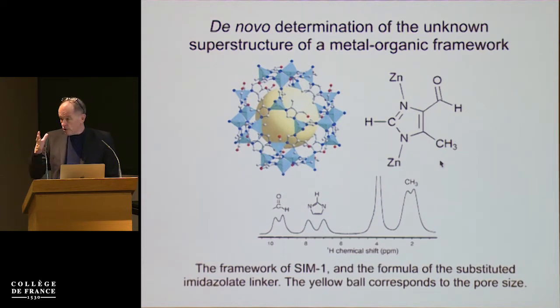The crystallinity comes from the order in the framework. When we do simple one-dimensional magic angle spinning NMR, this is our proton spectrum down here, and you immediately see why there might be a problem. You immediately see that each of these protons has two chemical shifts. And so that's telling us that the linker must be in two well-defined but different orientations inside the crystal structure. So the question becomes, what is this crystal structure that is compatible with two different environments of the linker?